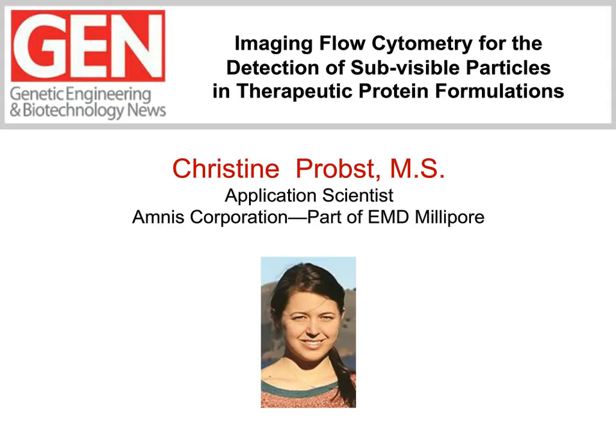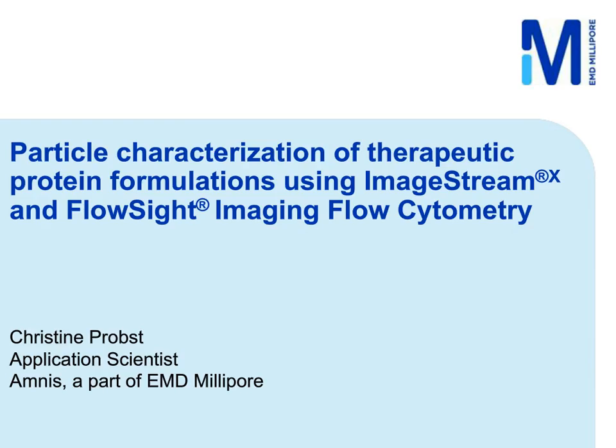Hi, everyone. Thank you for joining the webinar today, and thanks for the introduction, Jeff. Today, I will be discussing particle characterization of therapeutic protein formulations using ImageStream and imaging flow cytometry. The way this talk is structured is that I will first discuss some conceptual reasons why we believed imaging flow cytometry would be beneficial for this application. And secondly, I'll show some proof of concept data that validates these conceptual advantages. So let's go ahead and get started.